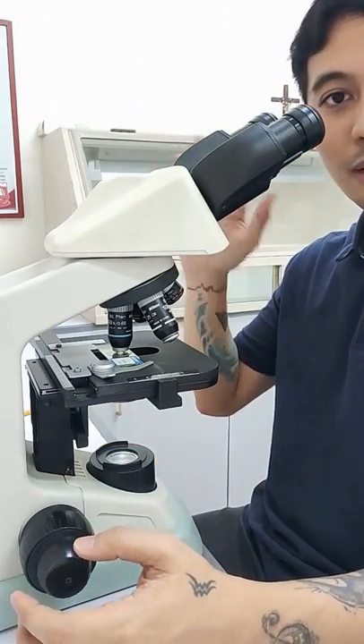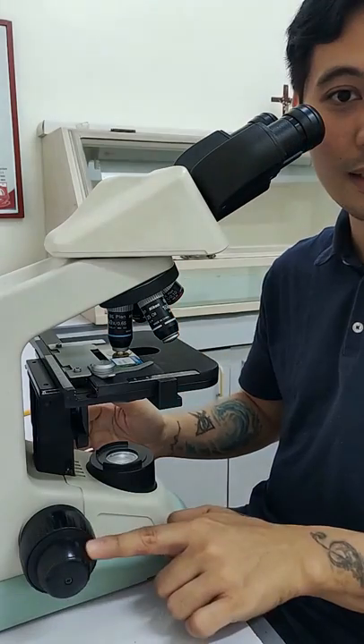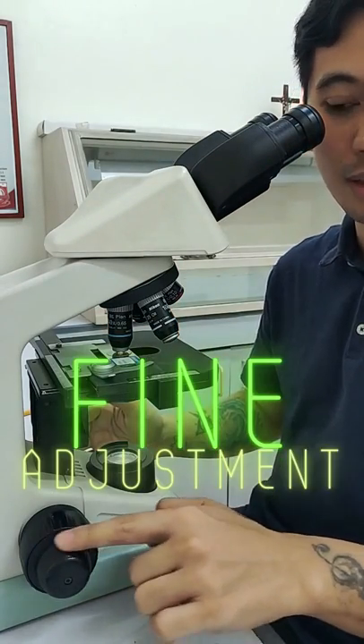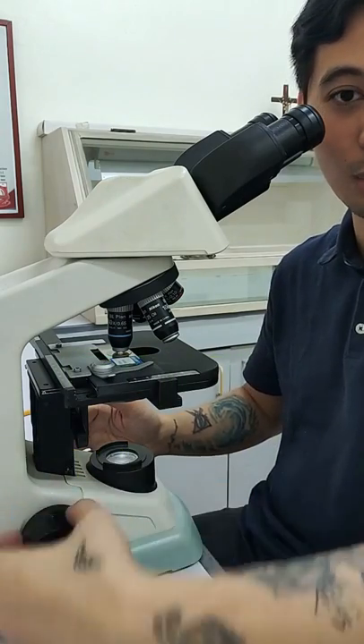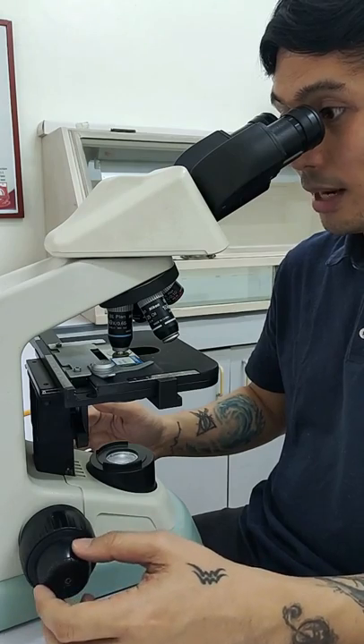And from there, even if it's kind of blurry or not clear, that's the time you would be actually using the fine adjustment knob — and not the coarse adjustment knob — when focusing in the high power field.